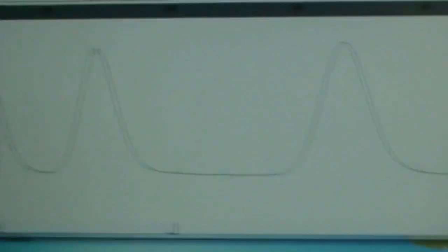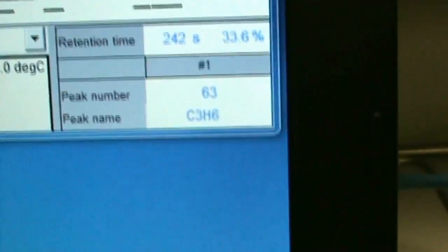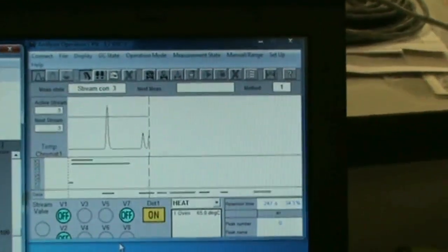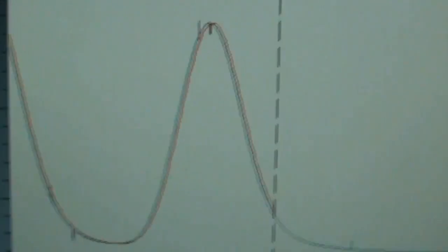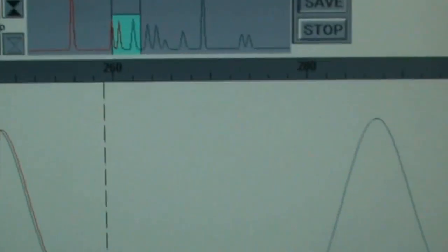At this point in time, I think I want to bust into the oven for you, but that's the gist on the Yokogawa, and it'll tell you which component is coming out right now in your time. But there ain't nothing to these things. I mean, they're simple analyzers. Pretty decent repeatability there. I mean, we're super zoomed in, so you can see how it's repeating.